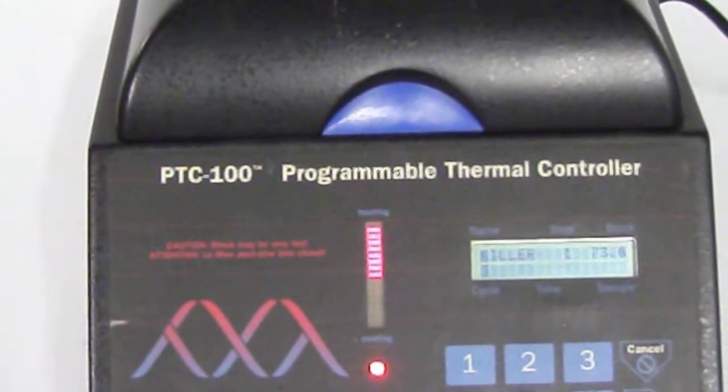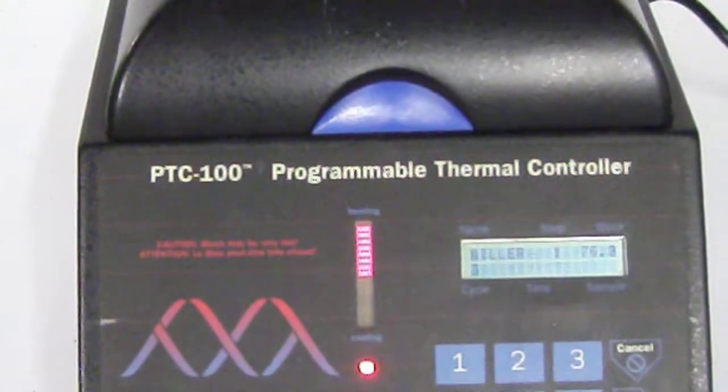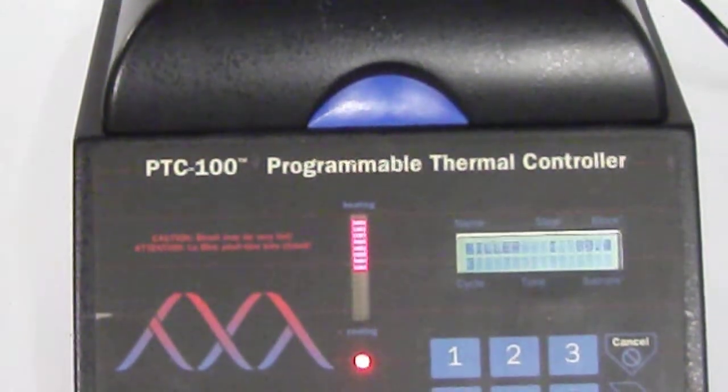Memory stores approximately 320 programs, and Cycler comes with 14 pre-programmed protocols.